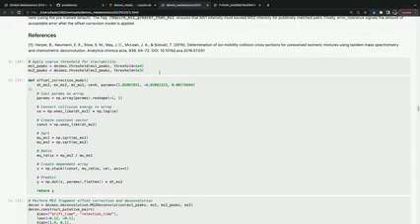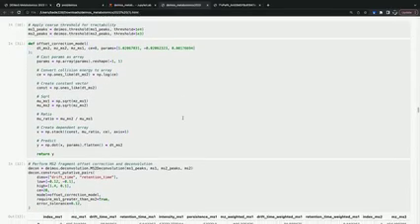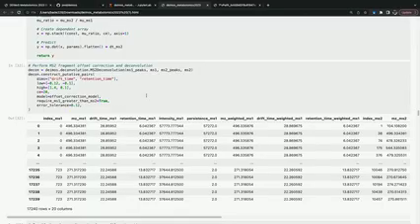But essentially, what we do here is we apply a threshold so that we are looking at some of the more intense features that were identified via peak picking. And then once that's performed, we use this MS2 deconvolution model, including the MS1 peaks, the MS1 raw data, the MS2 peaks, and the MS2 raw data. And then we construct pairs of MS1 features associated to those MS2 fragments. And you can, again, specify your offset correction model, so it'll apply that offset correction to your fragments.